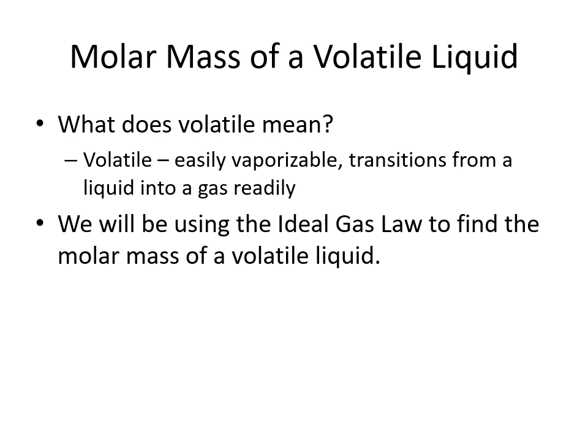By turning this into a gas, we can use the ideal gas law to help us figure out the molar mass. So what is the ideal gas law? What's the equation? The equation is the pressure of the gas times the volume is equal to the number of moles times R, which is a constant, times the temperature of that gas.